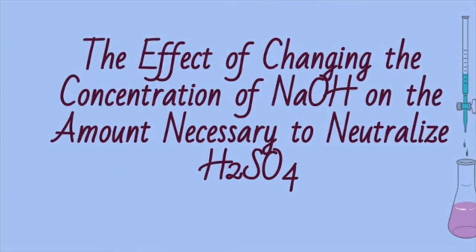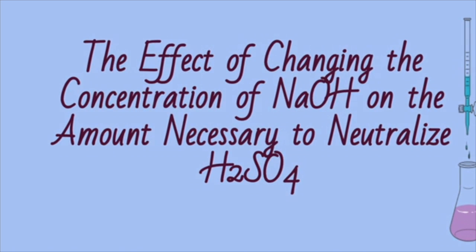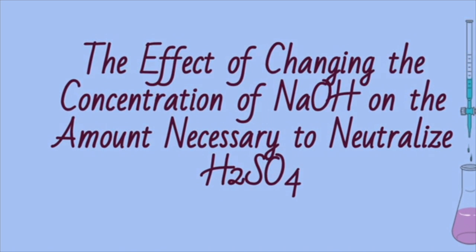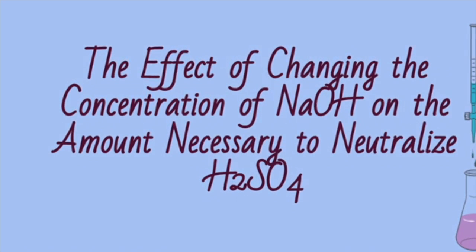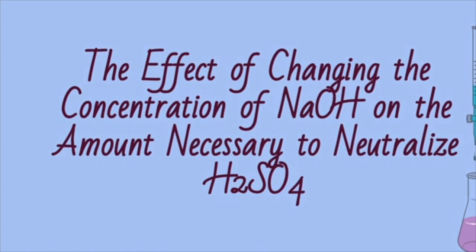Our inspiration for the project was we enjoyed dilution and we enjoyed titrating. We wanted to combine the two together. Our experiment was the effect of changing the concentration of sodium hydroxide on the amount necessary to neutralize sulfuric acid.